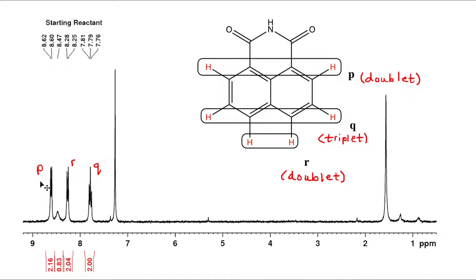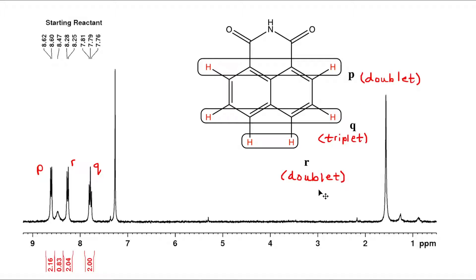I've assigned the signals to P, R, and Q protons. The signal that is a triplet corresponds to the Q protons, since it's the only triplet we would expect. P and R are both doublets, so to discern between the two, we look at the chemical environment of the P protons — they are closer to the imide functional group.